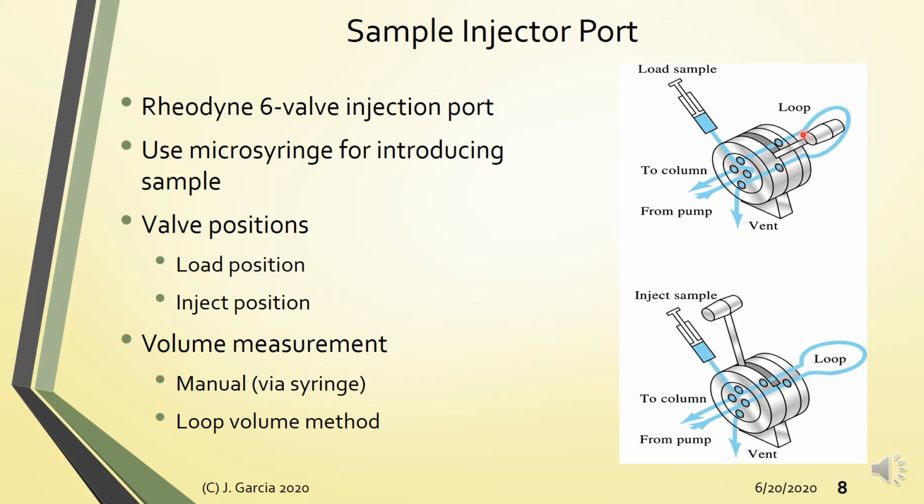Now, it has a valve, then you have here the parang syringe port, no? So the sample is also injected via a micro syringe. Similar to the one used in gas chromatography, no? Medyo different na yung volume and design. In general, larger ang volumes for liquid chromatography, okay, compared to the liquid samples injected in gas chromatography. Okay? So, yung construction ng microsyringe, similar lang din, no? It's made from glass with a stainless steel plunger.